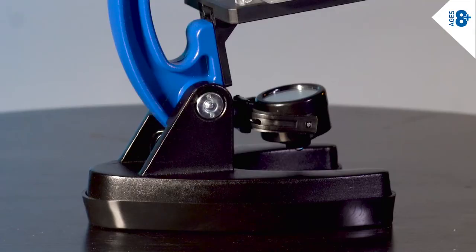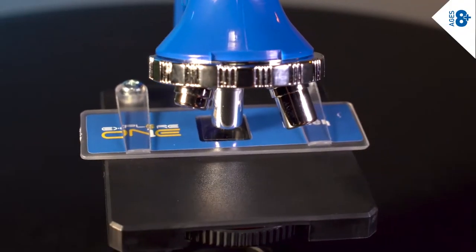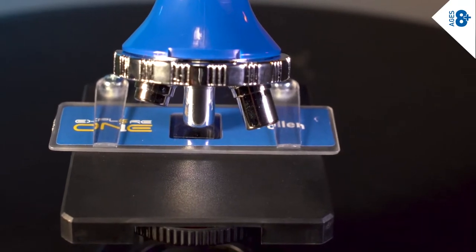The generous 66 by 73 millimeter stage secures the microscope slides and is large enough to center any specimen under the objective lens easily.